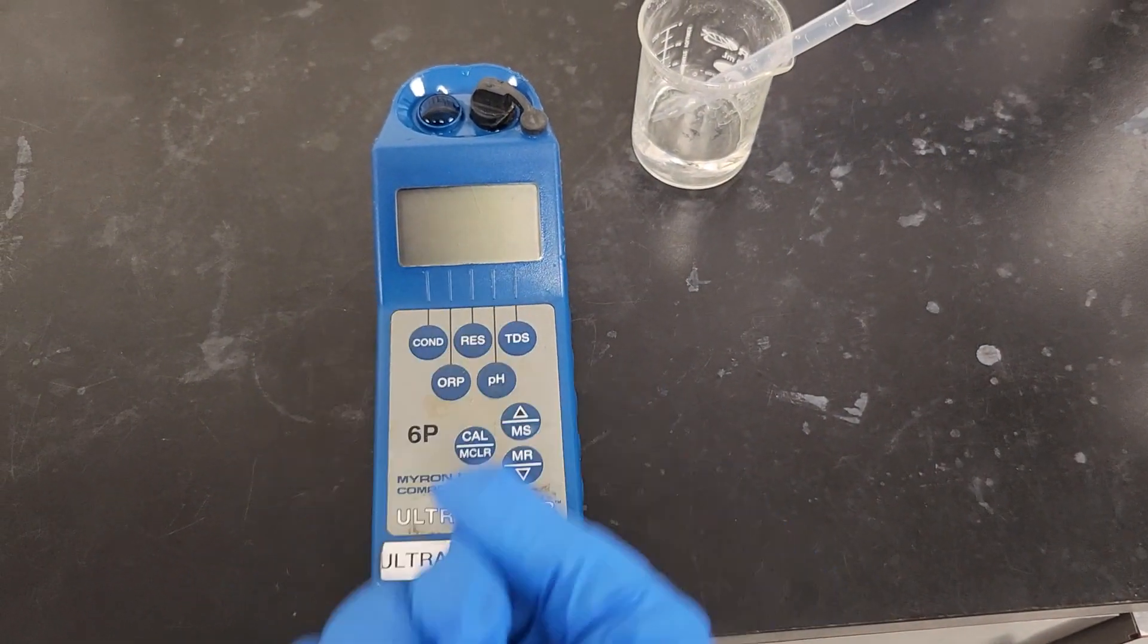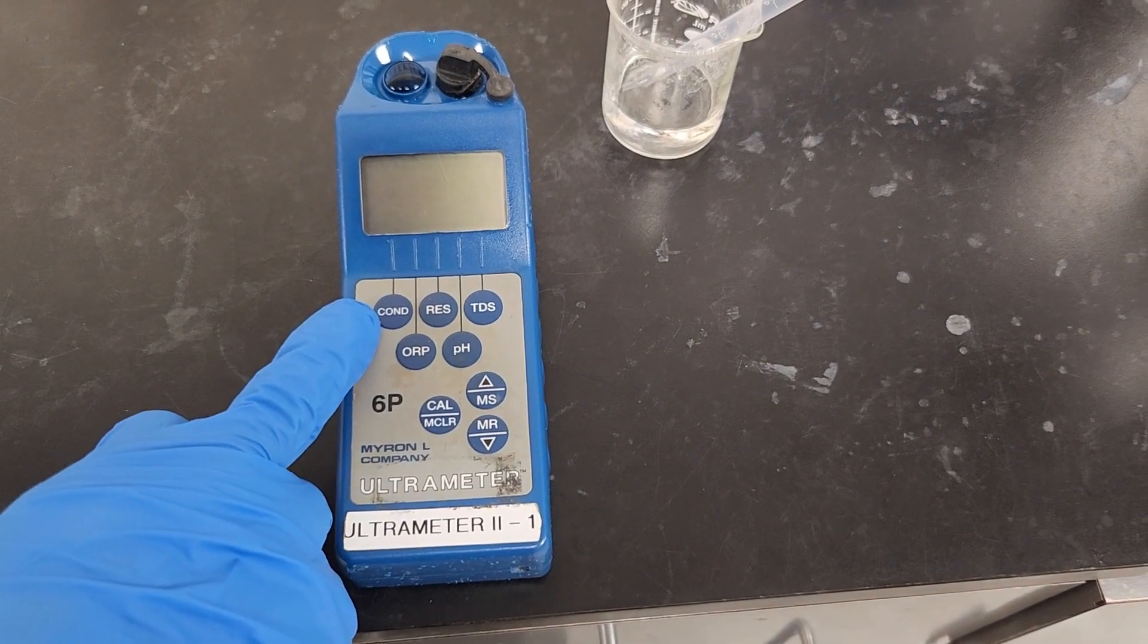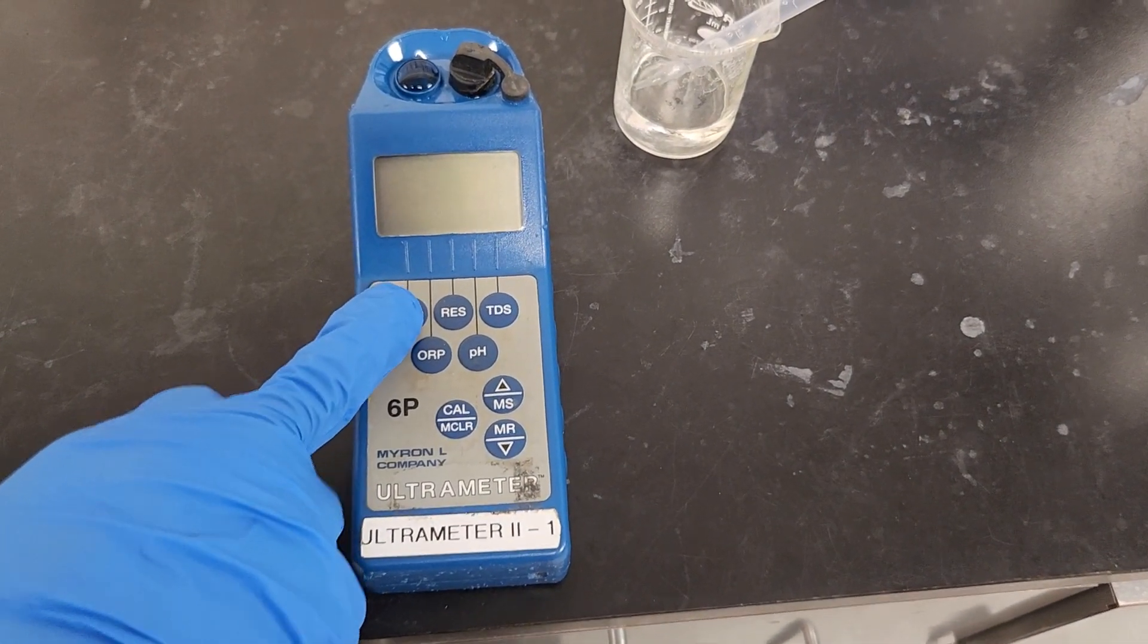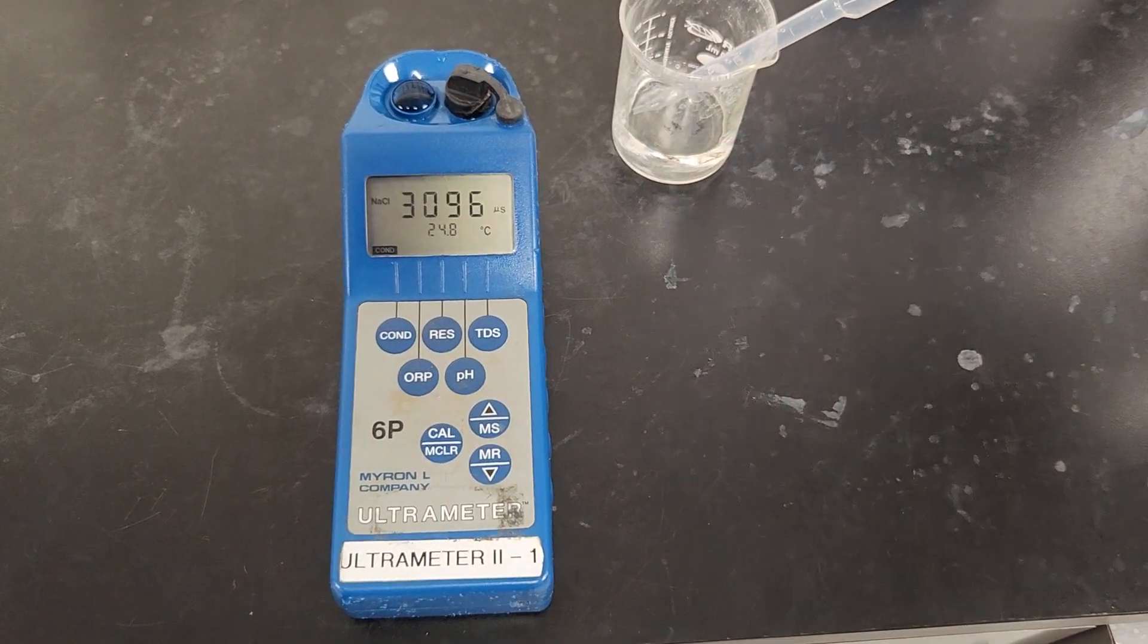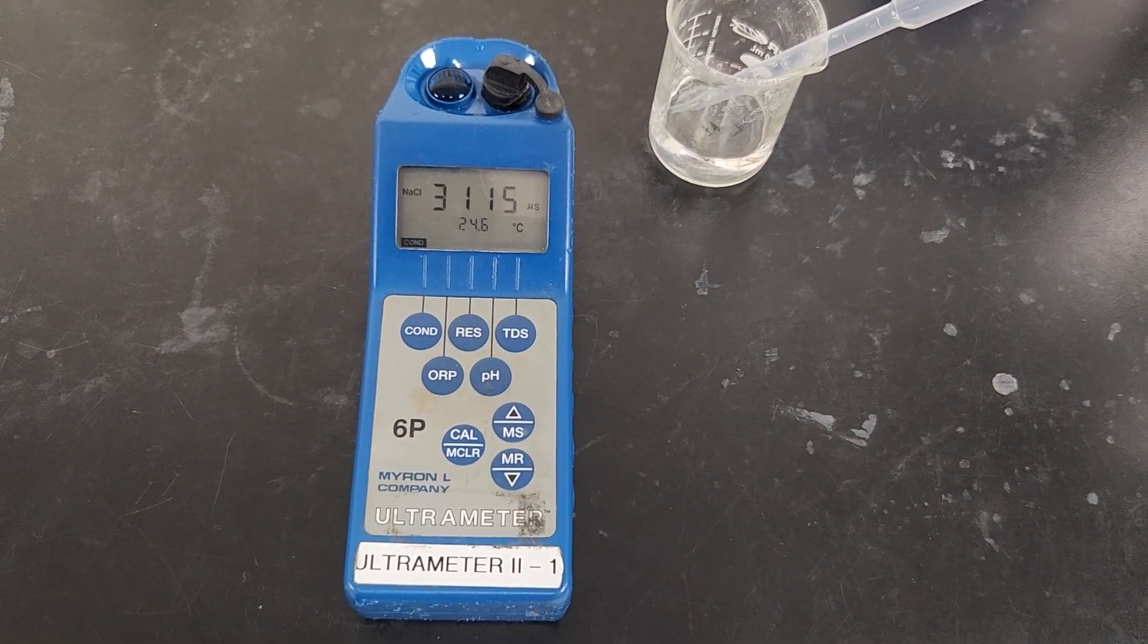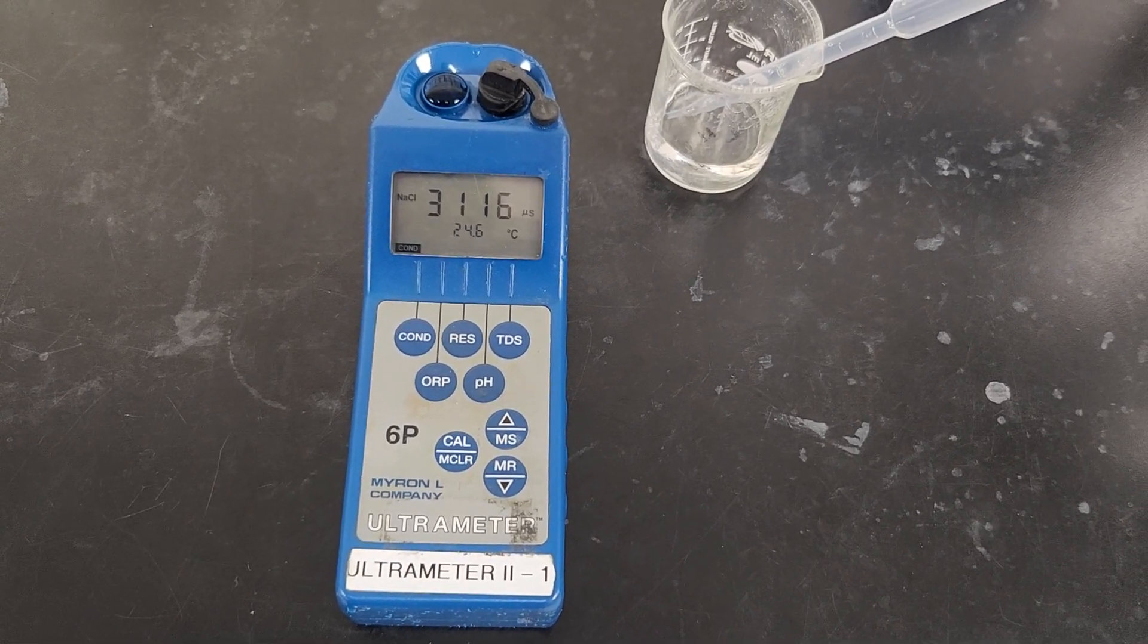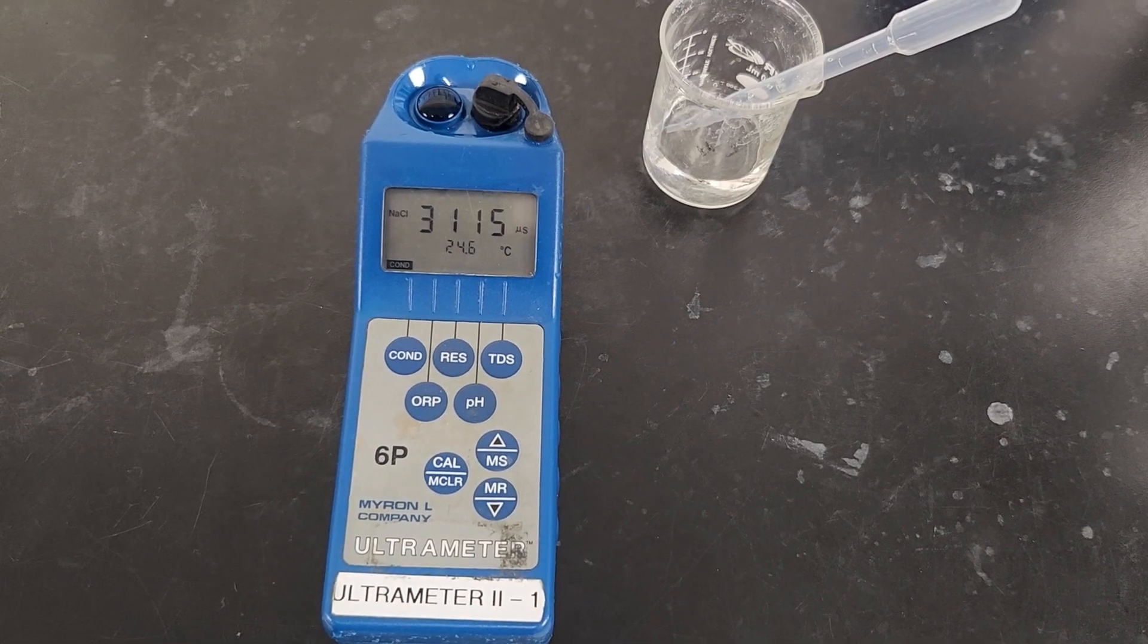And here 'cond' means conductivity and I'll press it. So it's giving us 3115, 3116, between that range, 3115 and 3116.